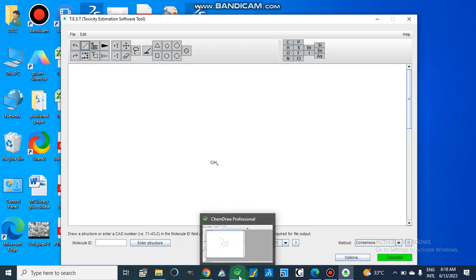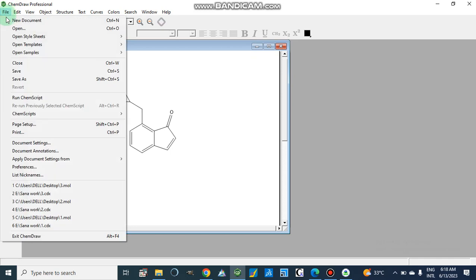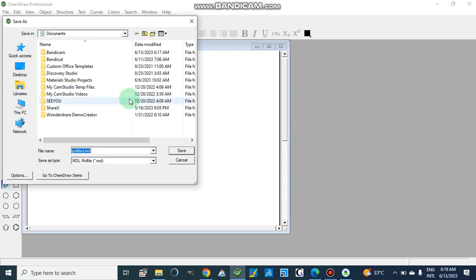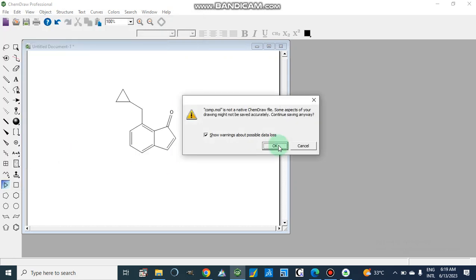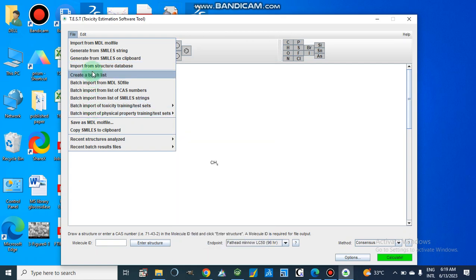Let's suppose we have this structure for which we want to estimate toxicity — including oral rat LD50, mutagenicity, and other environmental toxic effects. We will save this file. From here we will save it as an MDL mol file. I am going to save it on the desktop with the name 'compound'.